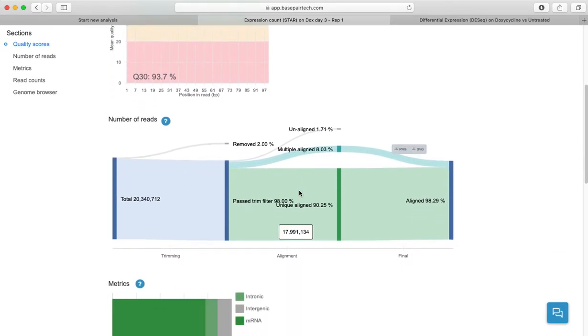After trimming, reads are typically aligned to either a reference genome or transcriptome. Alignment is the algorithm to figure out which gene a read came from, and Basepair provides the popular STAR tool for alignment. Another option to note, and this requires a separate pipeline, is if your species has no reference, is to assemble your own transcriptome using Trinity, which is also offered on Basepair.